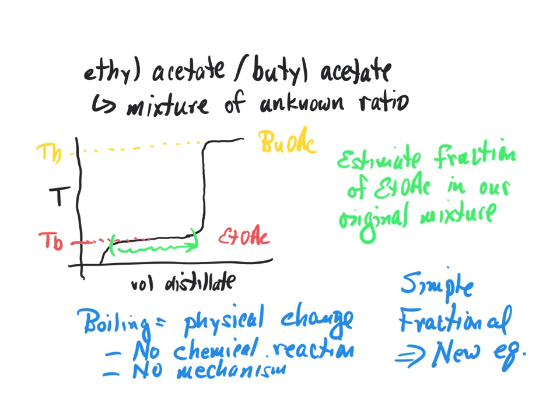There will be one set up in the laboratory that you can use as a model to help you set up when you get there, but you'll need to have both of them listed in the new equipment. Also, since there's no chemical reaction and no mechanism, there will be no theoretical yield. Okay? We'll see you in lab.